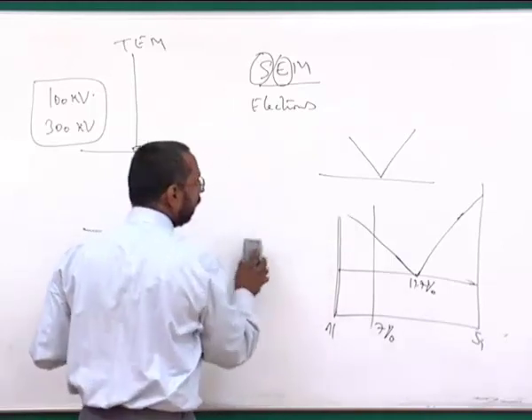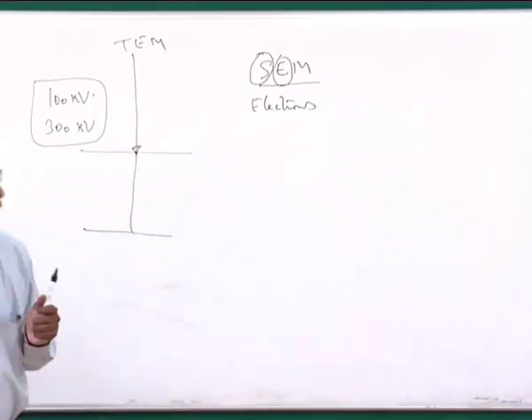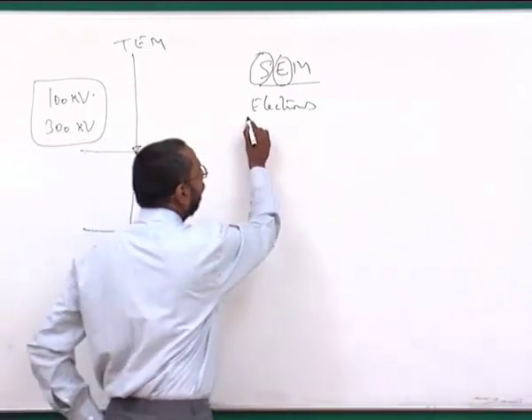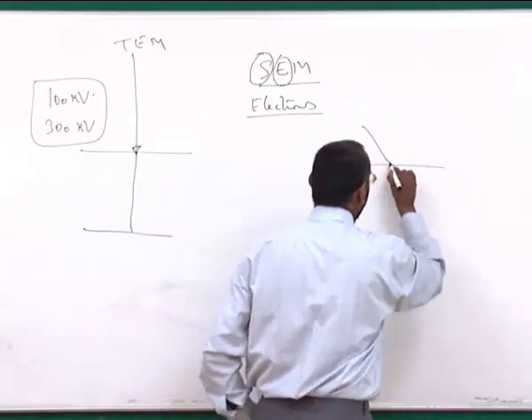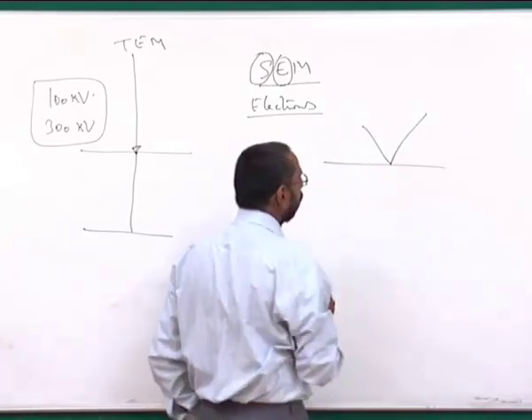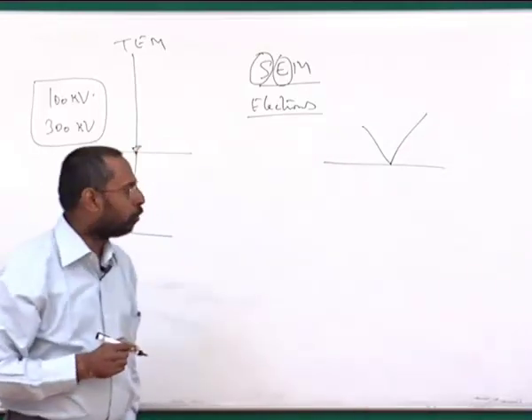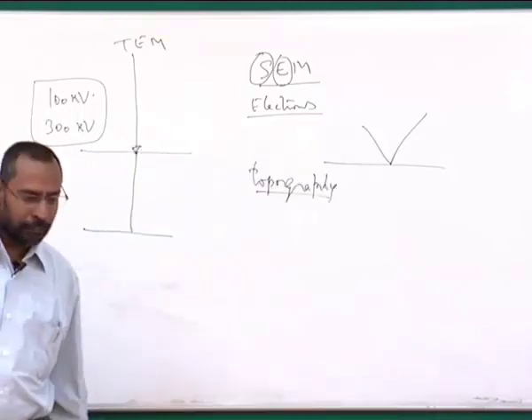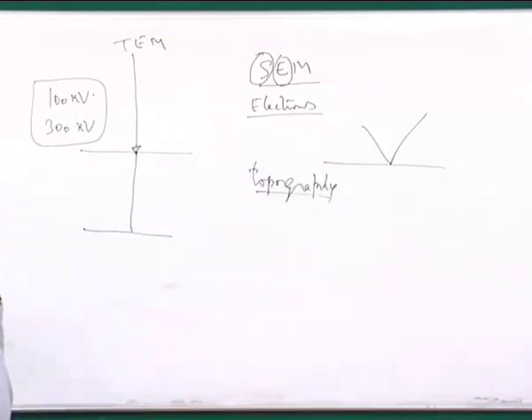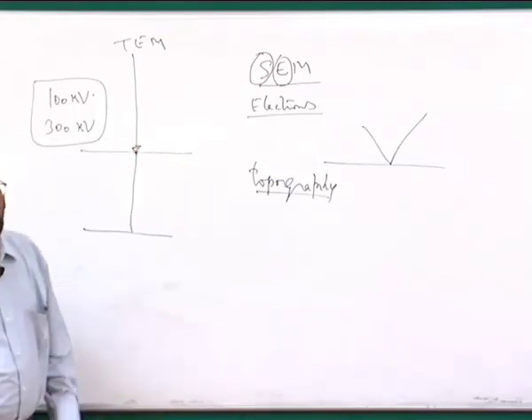So that is one advantage of this particular scanning electron microscope, for which it has become very, very popular. The second thing that you can do with this microscope, again coming from the depth of field, is that you can use it to understand the surface topography. Particularly in an optical microscope, we polish the sample thoroughly to be able to see the image.